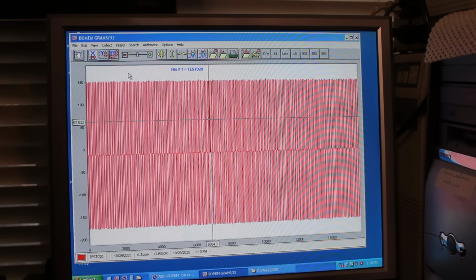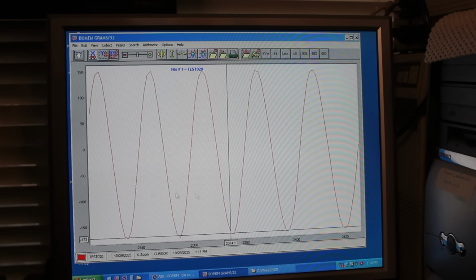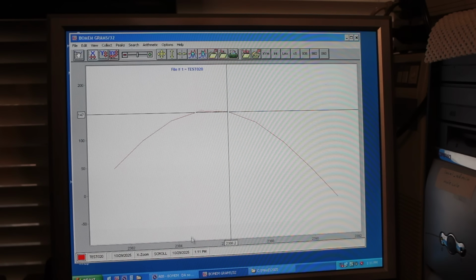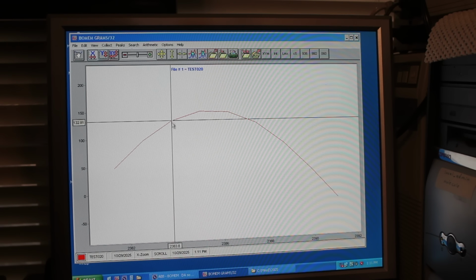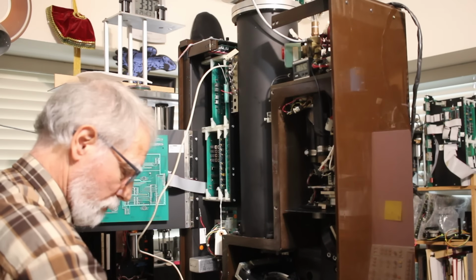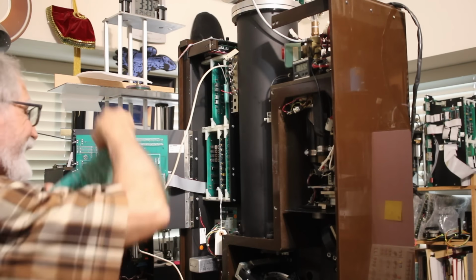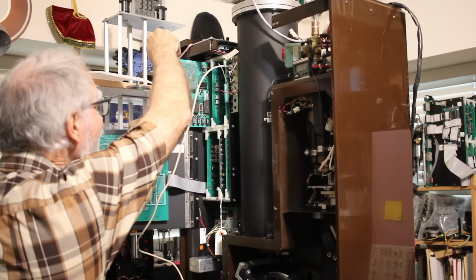And then, so basically we've got lots of repetitions of the sine wave as the system was collecting data, and we zoom in. We've got a nice clean representation. If you look closely, you can actually see the limitation of the data points. So you can see we have a data point here, got another data point up there, another one here, another one here. If this was our infrared data, in order to accurately represent this frequency, we would need a minimum of 2 data points per period. And for this simulated 500 wave number data file, we got plenty of data points.